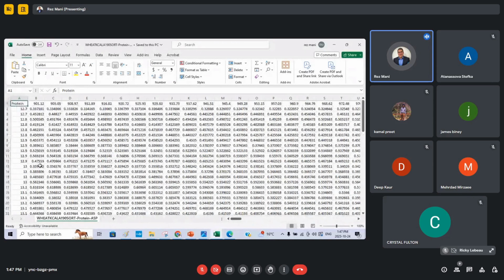And normally what we do is that, let's say we have 100 samples, we divide it into 2/3 calibration, 1/3 validation. And we organize them based on increasing ingredient. And then we would choose every third one for validation. So we can separate the full file of 100 into 66 calibration and 34 validation.